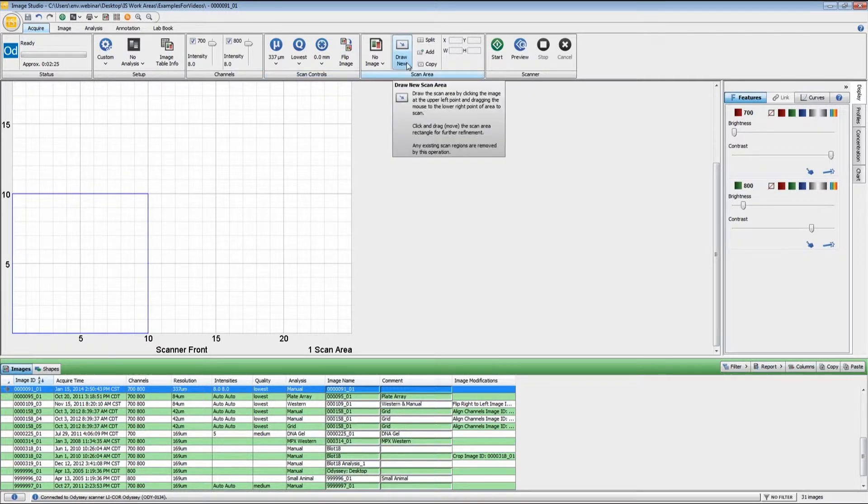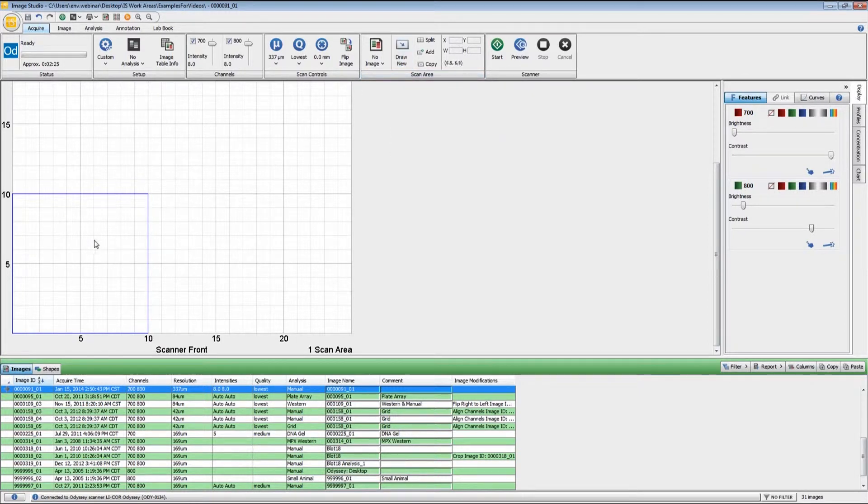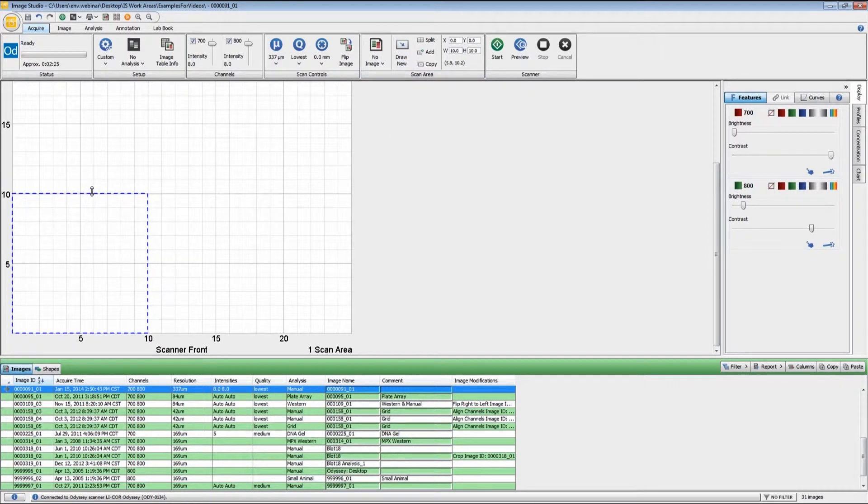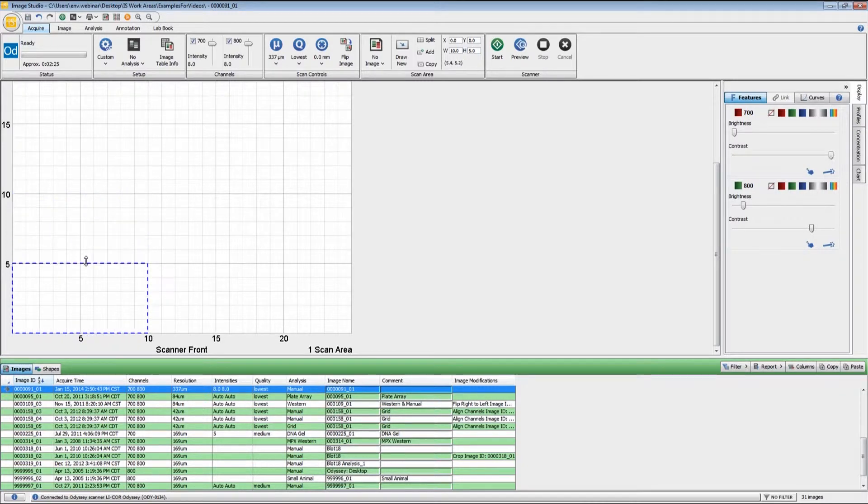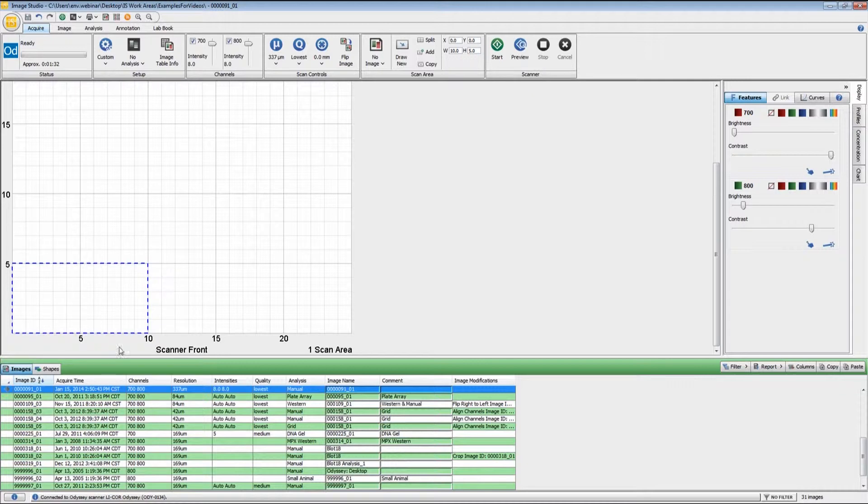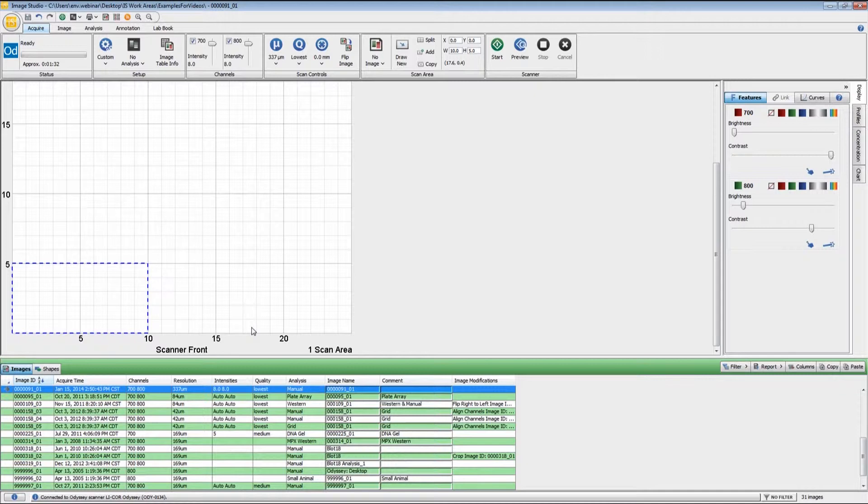For the scan area, I can either click Draw New, or if I come down here, I can click in the middle, and then I can adjust my scan area depending on the dimensions of your blot. The coordinates along the X and Y axis here can be determined by using the rulers that are on the glass on the scan bed.